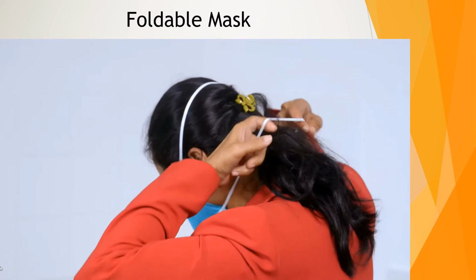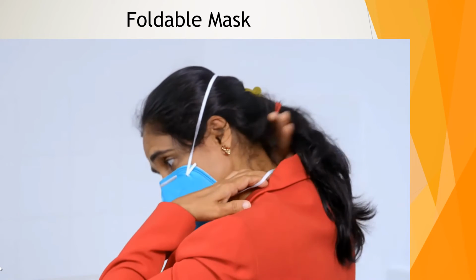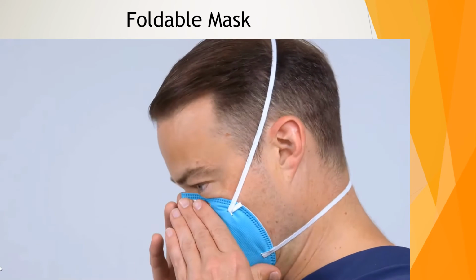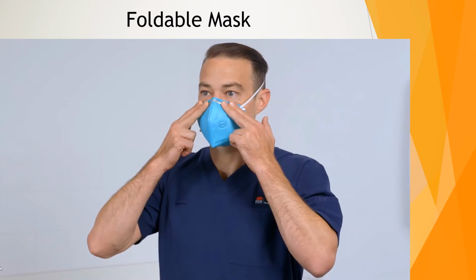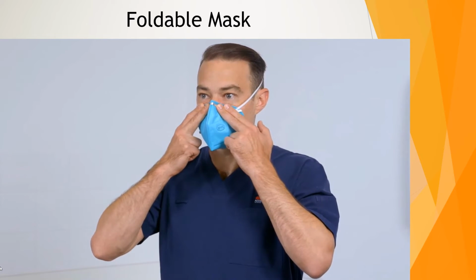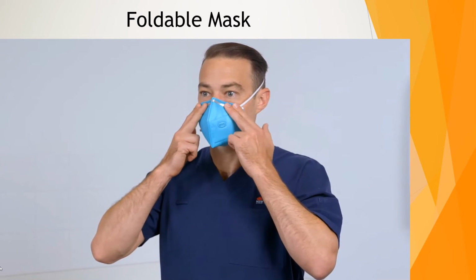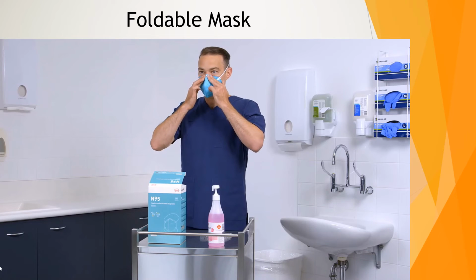Make sure that hair, facial hair, jewellery and clothing are not between your face and the respirator, as they will interfere with the fit. Compress the respirator to ensure a seal across face, cheeks and the bridge of nose. Continue to adjust the respirator and secure the edges until you feel you have achieved a close fit. Once fitted, perform the fit check.